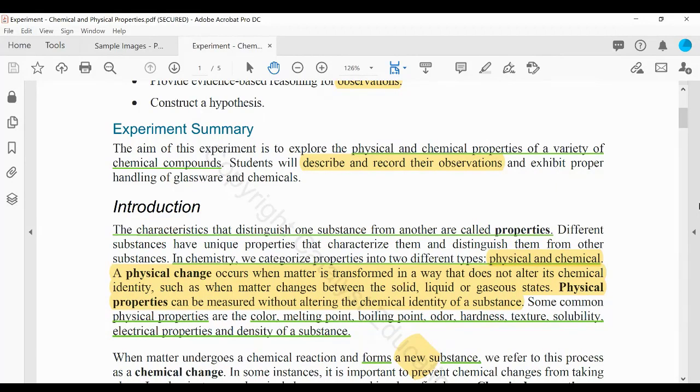There are different parts in the reports that we are going to go over, A, B, C, D. In one section, you mix a piece of copper metal with a colorless solution of silver nitrate. We will go over that, and I will guide you to learn how to observe, what to observe, and how to take notes.